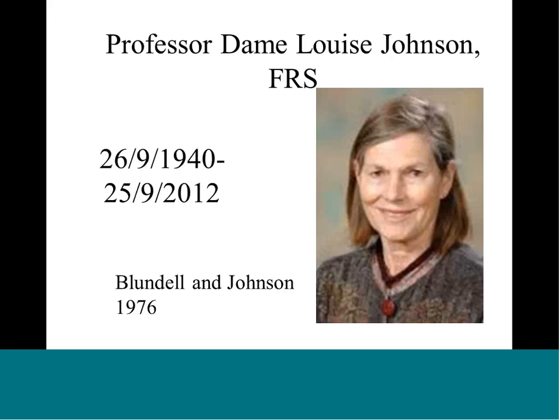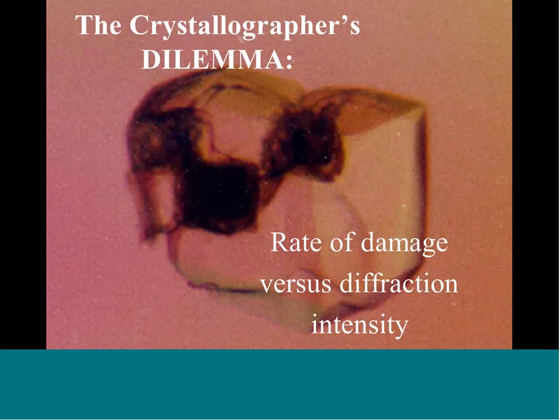Our great dilemma as macromolecular crystallographers is that if we give an unattenuated beam incident on our crystal, we'll damage it pretty fast — very fast at room temperature, and now at modern synchrotrons it can be quite fast at cryo temperatures as well. We get the high resolution data but then we kill the crystal. On the other hand, if we use an attenuated beam, we can get more data but at lower resolution.